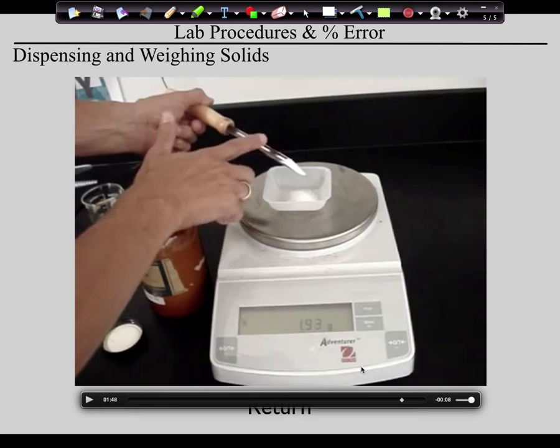So technically what you should do is throw this away and start with new, so you're not sticking the spoon into the boat. You're okay if you do. We're not that caught up about it, but never pour out of the boat into the stock bottle. Is that okay? Were you going to say? Yeah, well, if you touch the spoon that you need, yeah.